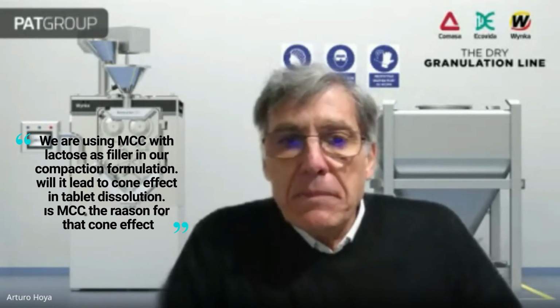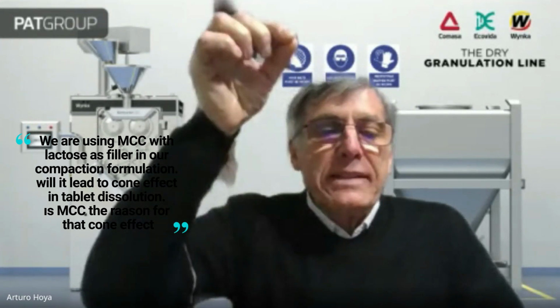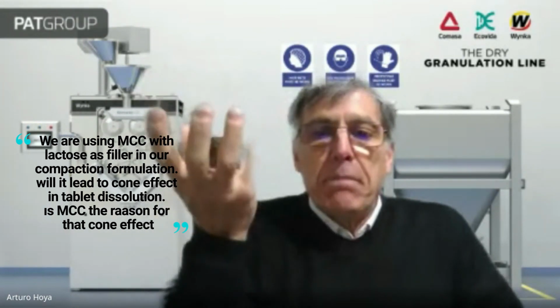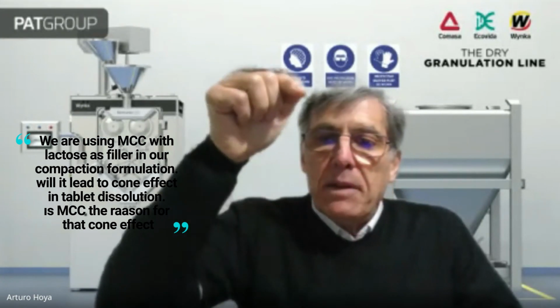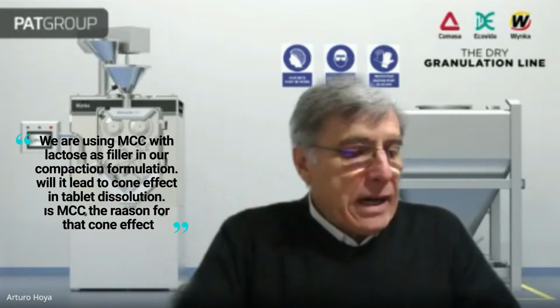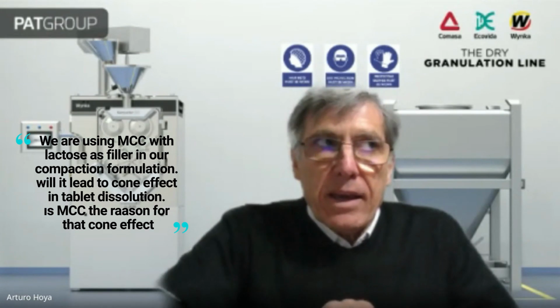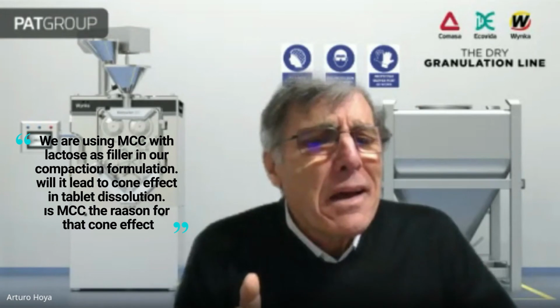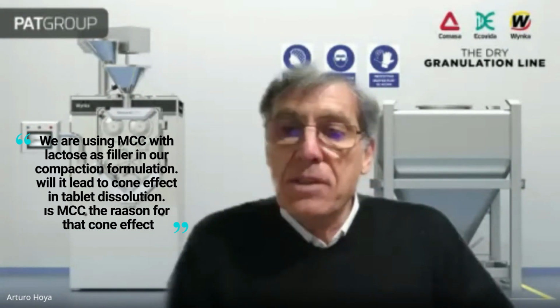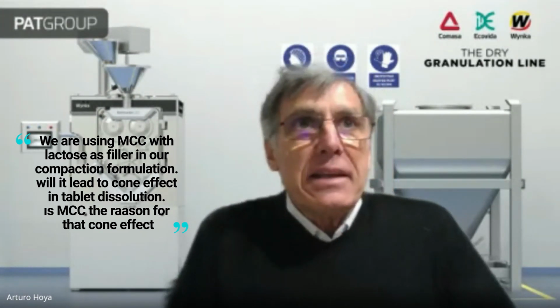Osen, you say when you put the tablet into the vessel of the dissolution machine, the tablet goes to the bottom and produces a cone of powder. This is the question? Let's see if we have Osen active. Yes, that's his question. He is just replying. Yes. Okay, Osen.